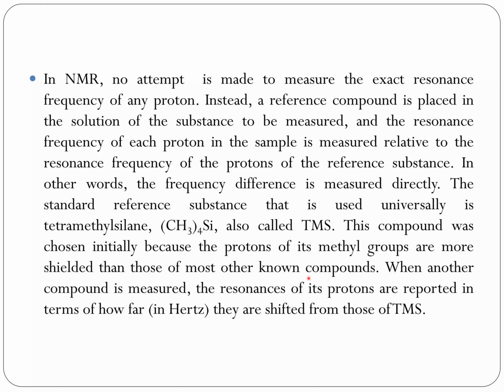So actually, TMS is a standard. In UV or fluorometry, we sometimes use some blank. Actually, TMS is the blank of NMR spectrometry. For sample preparation or sample application, we need to put some blank, and actually TMS works as the blank.